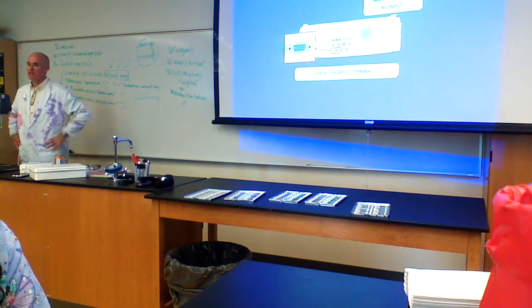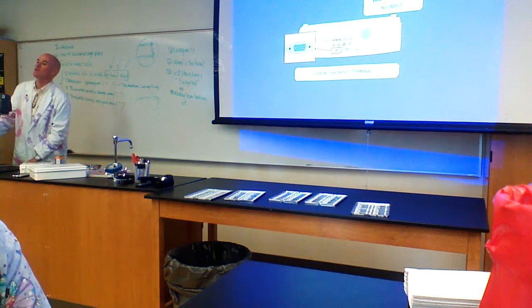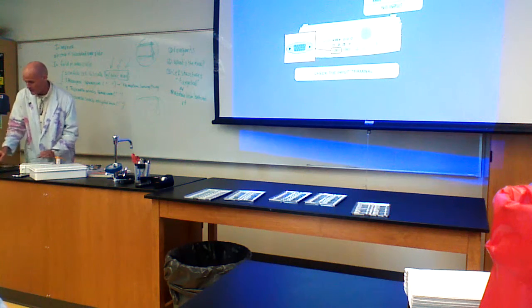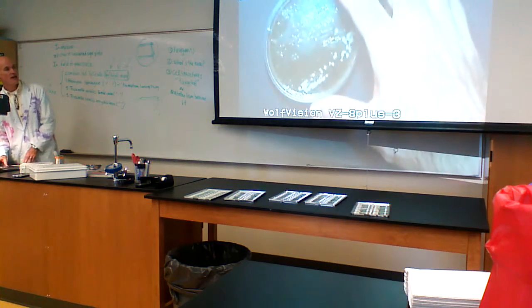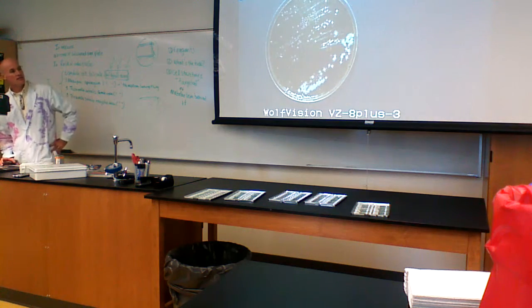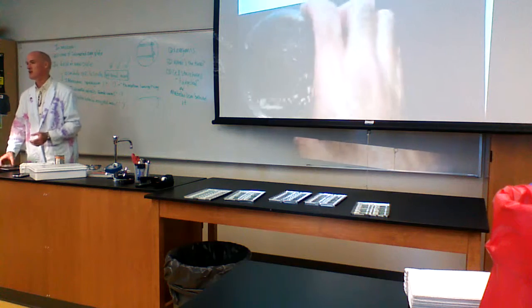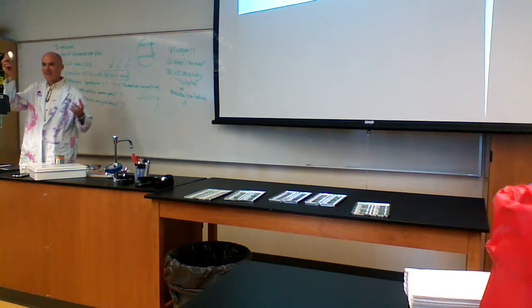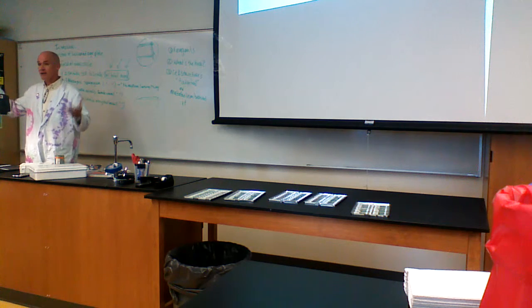That's a hard one for me to ask many questions on because I would hope I could put a plate in front of you that had obvious differences like this. Like if you saw a soil microbiology plate, let's say. This is not a soil plate, but what if I did this? How many species minimum are on this plate? 2. Yeah, okay, I'm going to put a plate like that on there so everybody got that, right? That's worth rewarding. That's something you've learned this semester.